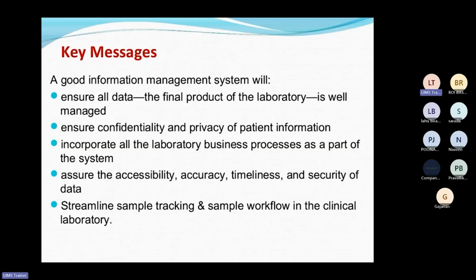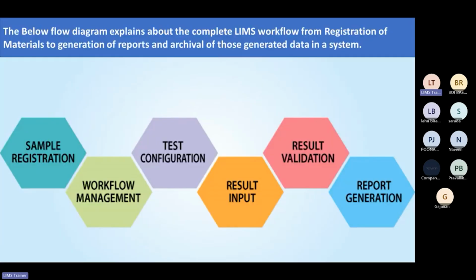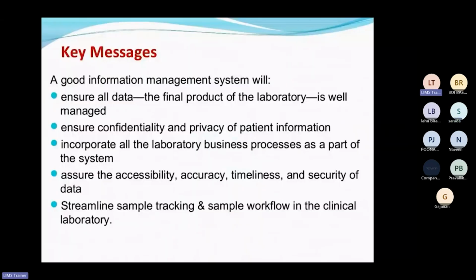So all the data will be available with the software, and there will be notifications. Suppose one HPLC system is there, and its calibration is due next week. The software will automatically generate a message or a notification to the person who is responsible for the calibration of that particular HPLC system. This is how it smoothens all the activities involved in the laboratory, and this is how the information is managed inside the software.